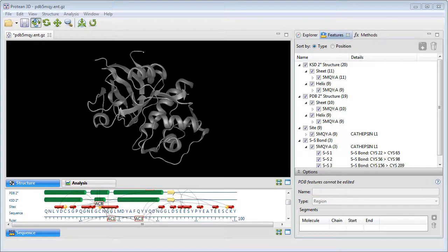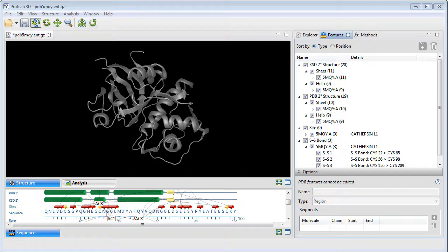LaserGene's Protean 3D lets you add custom annotations to an open protein sequence or structure. Here's a structure I downloaded from the RCSB protein databank.